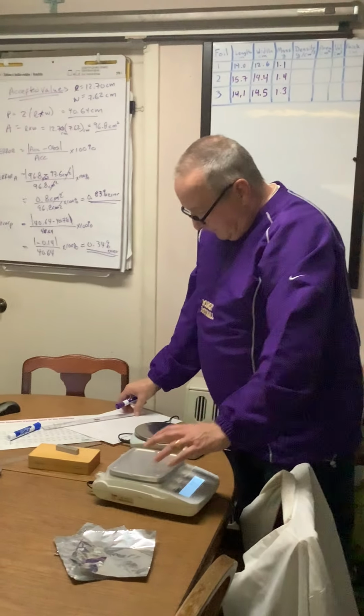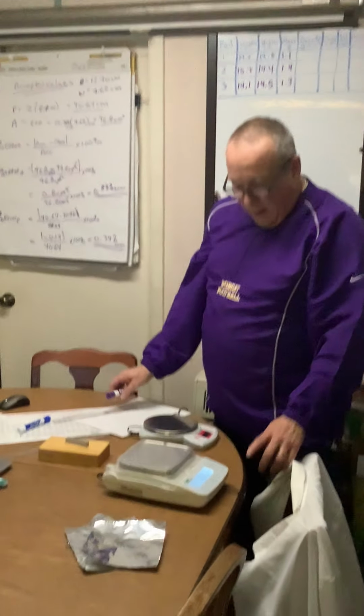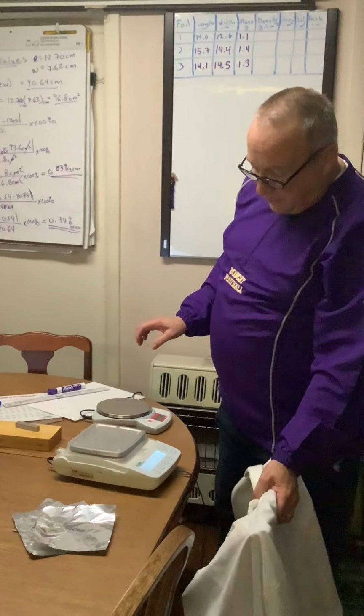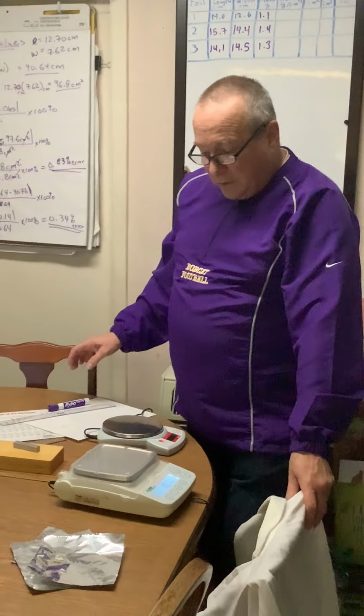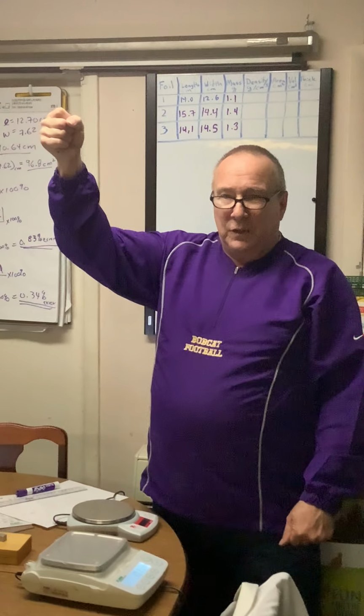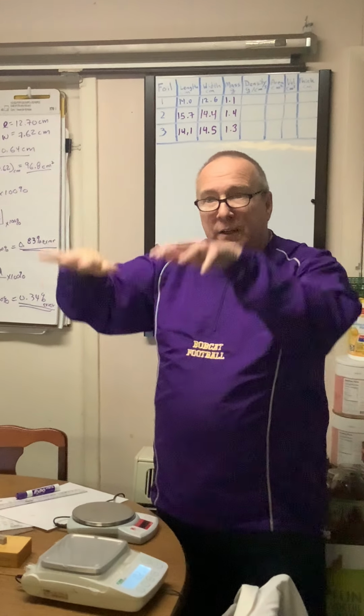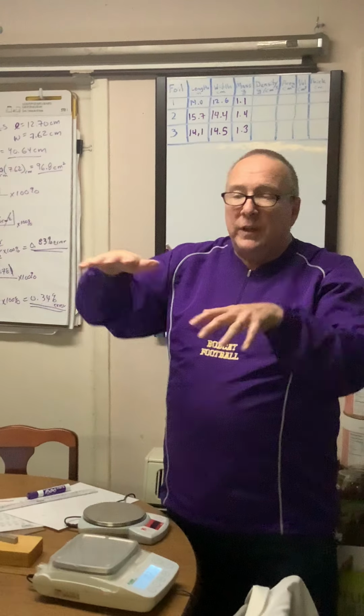And I just weighed them. I'd like to say something about that balance there, and that is that this particular balance is a balance. It's not a scale. A scale is what you see Lady Justice, or the Muse of Justice, holding in front of the Supreme Court with the scales that balance. That is a scale. This is called a balance.